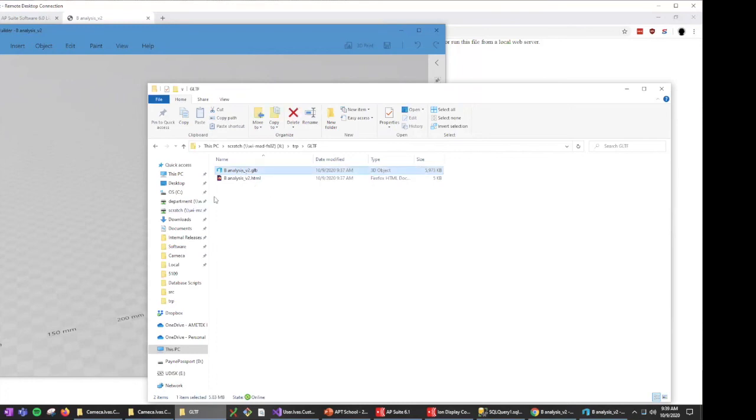Yes, but so this is the replacement for VRML. You don't need a plugin to view it. You can view it directly from a browser without a plugin. It just uses a little bit of JavaScript. So if I had a web server and I dropped these two files on my web server and I browsed this, it would work. There's just a weird local policy where you can't load a local file.